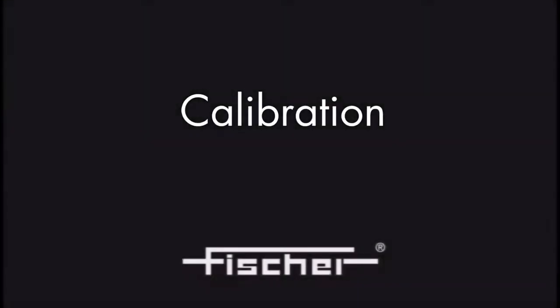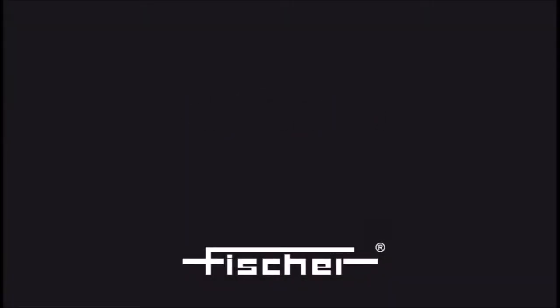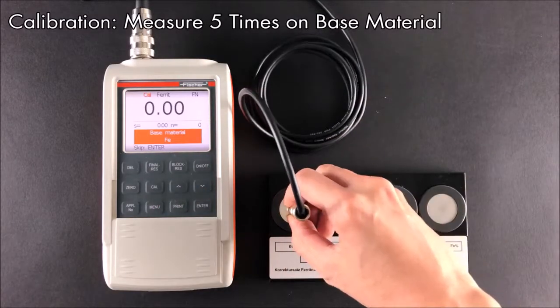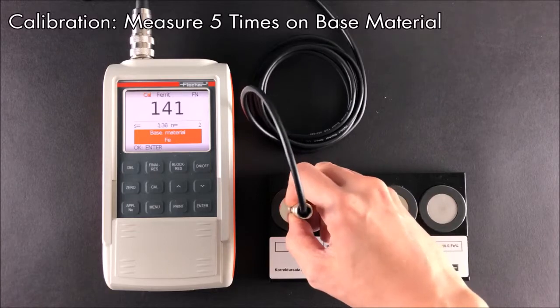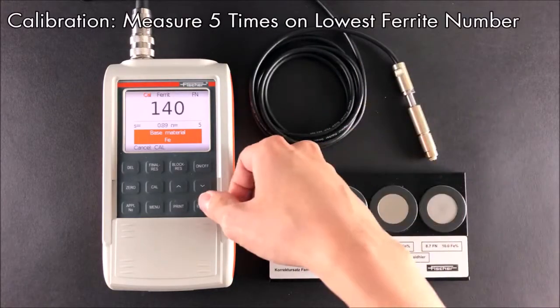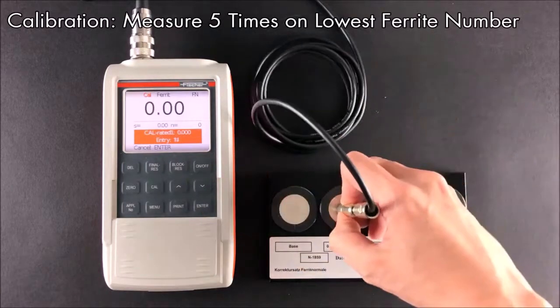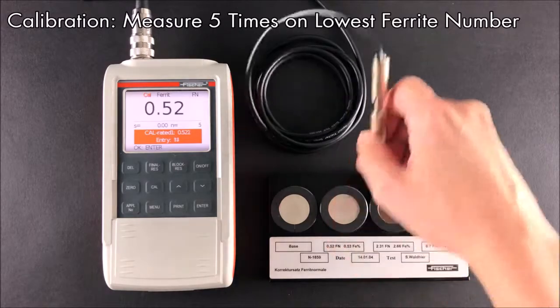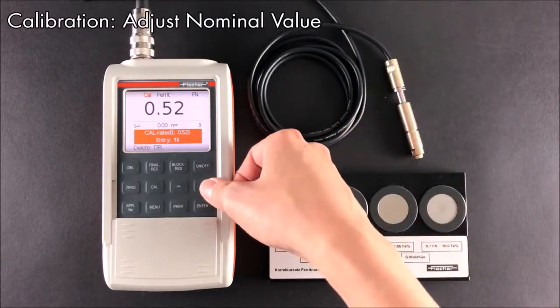Next, I will perform a calibration. Measure the base five times. Then measure the calibration standard with the lowest ferrite number five times. Adjust the nominal value of the calibration standard.